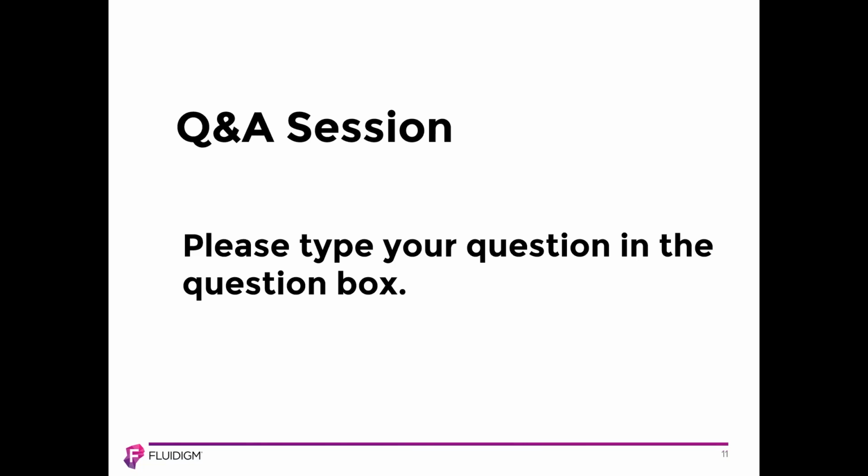Thanks, Lindsay. So I see some questions are popping up. The first one is a mass cytometry question for CyTOF. And the question is, how many parameters can I have in one CyTOF panel?